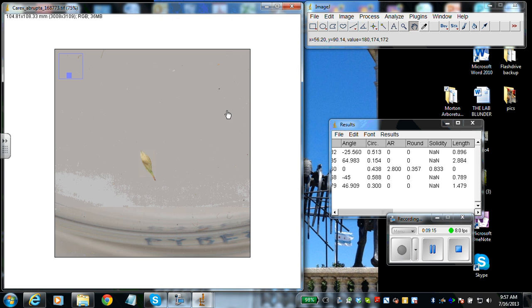If you have any questions with this, obviously read your protocol, ask your teacher, and we'll have the option to be able to ask scientists if you have questions about any of the measurements that go along with these images.